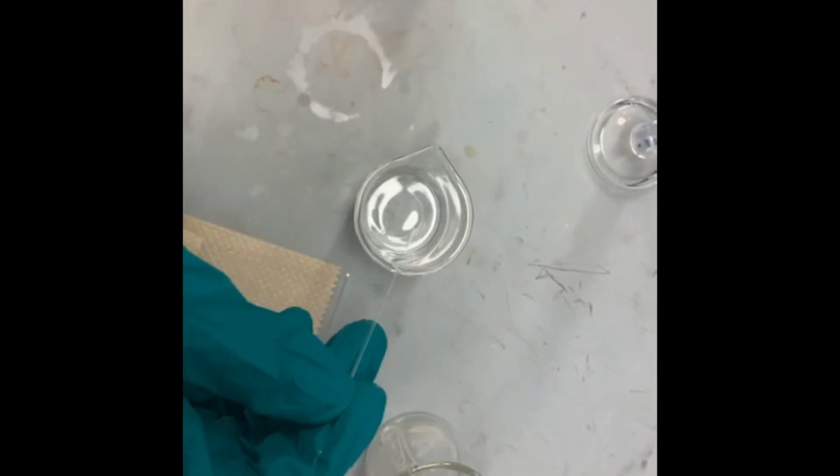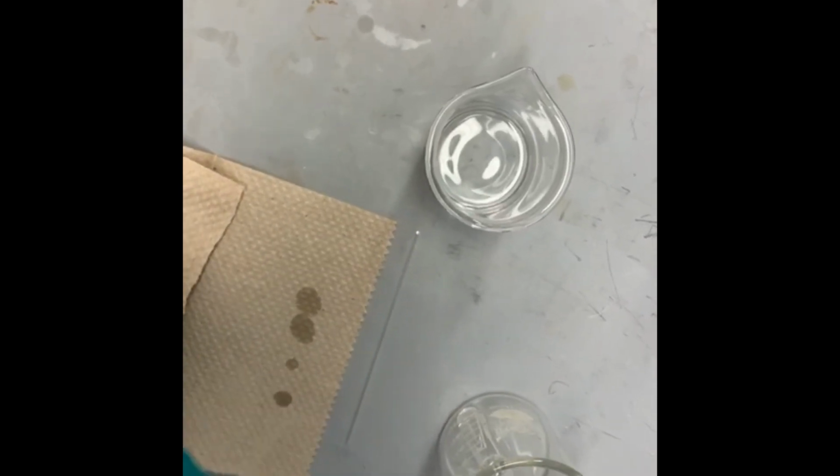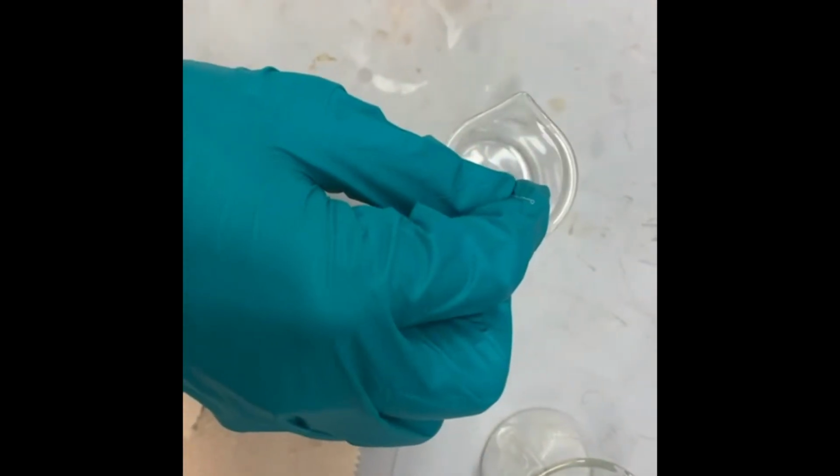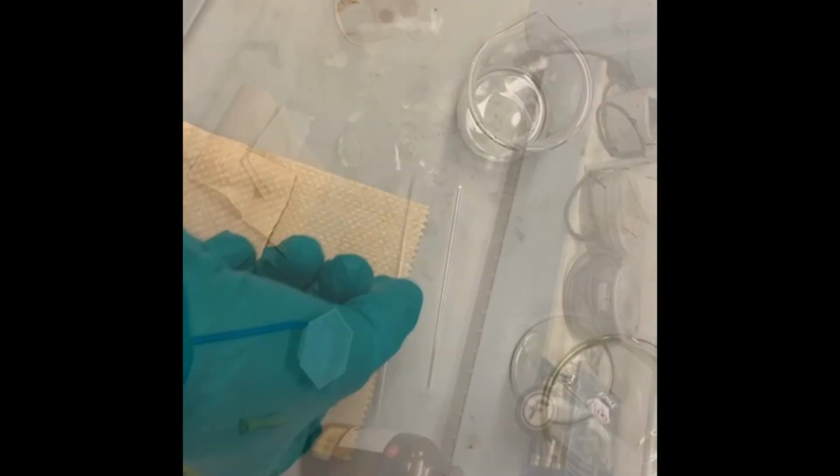and then to clean the spotter, to reuse it, just dip it in a solvent. It could be acetone or hexane or whichever solvent you're using, and then just dip it on a tissue paper a few times, and now this capillary tube or spotter can be reused again to spot another compound.